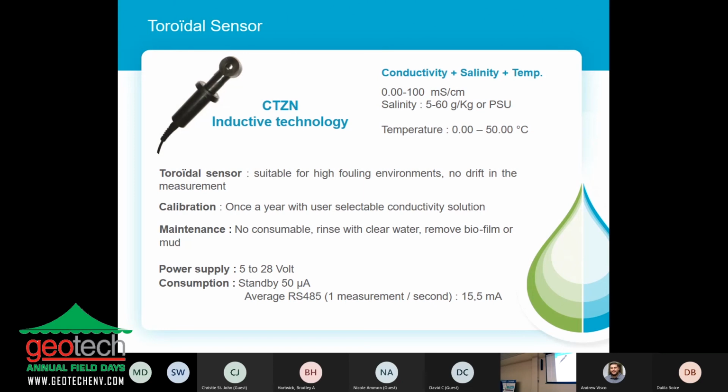And I think you had mentioned earlier that all of the calibrations are stored in the sensors themselves. Did I understand that correctly? Yeah, that's it. The last 10 calibrations are available and stored inside the sensor. And I think when we downloaded last, you had mentioned that you can't reset to a factory cal if you're... All factory calibrations are stored really hard in the sensor. You cannot delete them, and you always can come back to factory calibration. And that would be something that would typically be recommended if the slope of your calibration, if you accepted a couple bad cals and you weren't as confident in your reading results. Yeah. Sure. Okay, thank you.